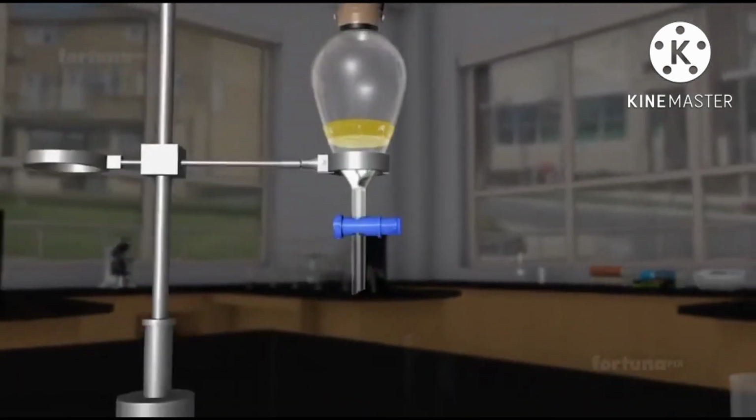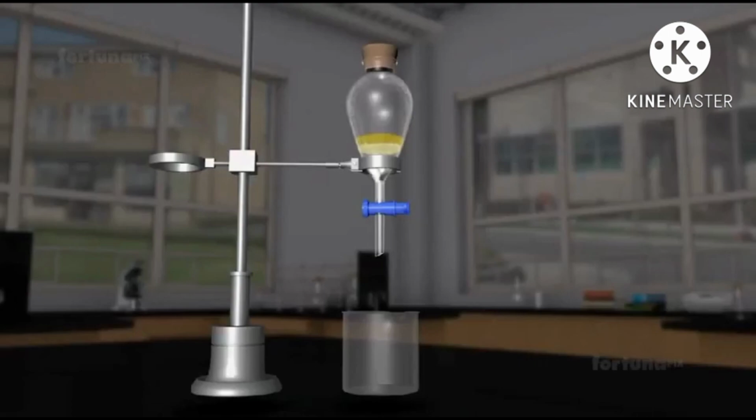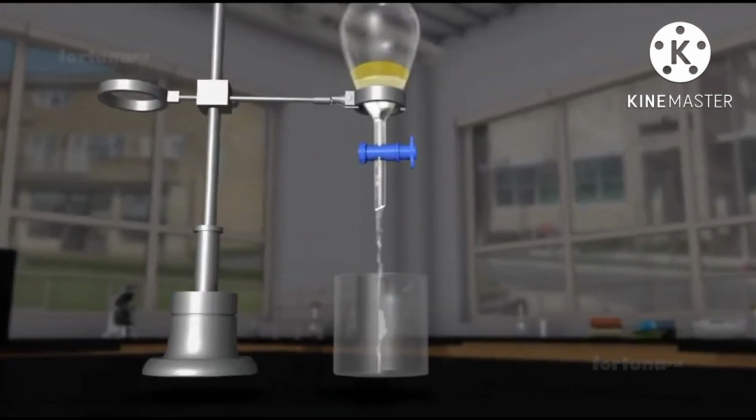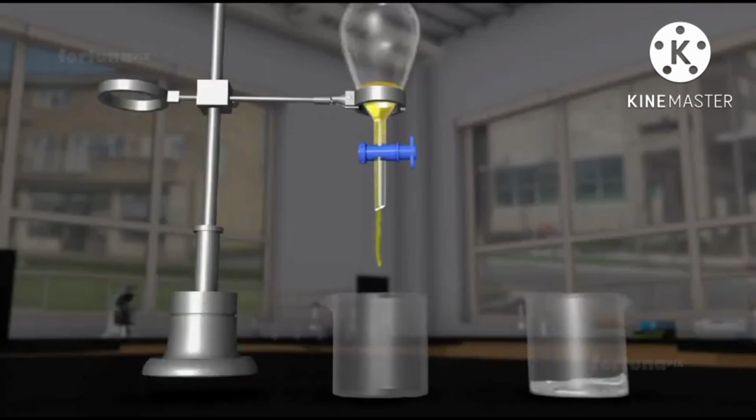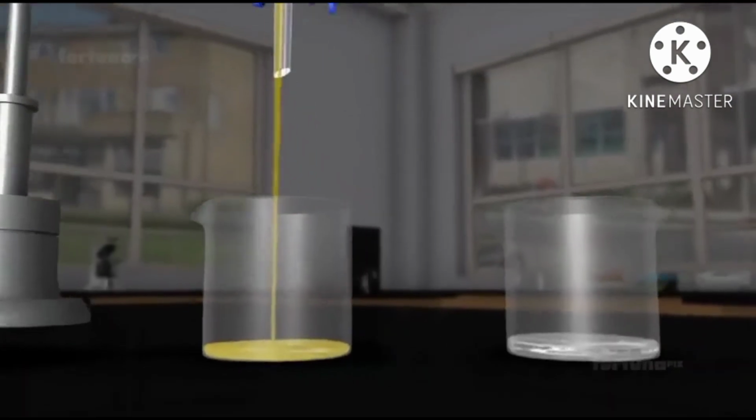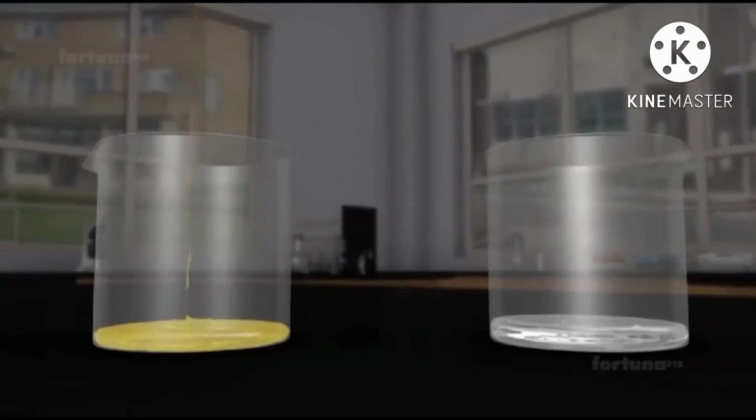Now, we'll place a beaker underneath the separating funnel and remove the stopper. We can open the tap and let the water collect in the beaker, closing it once all the water drains out. The remaining oil can be collected by placing another beaker beneath the funnel. Now the two immiscible liquids have been completely separated.